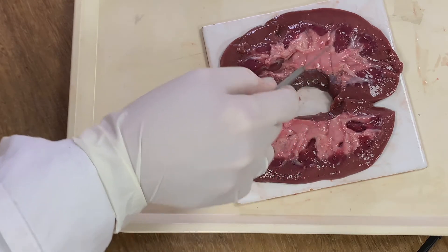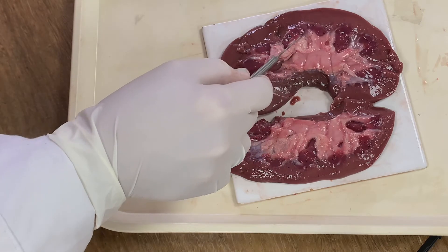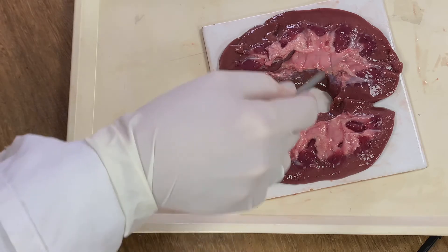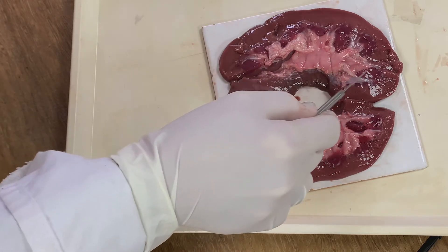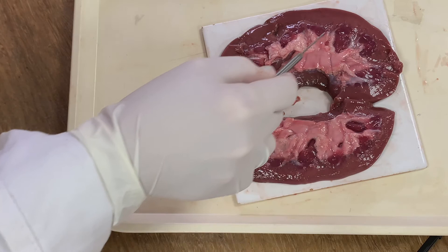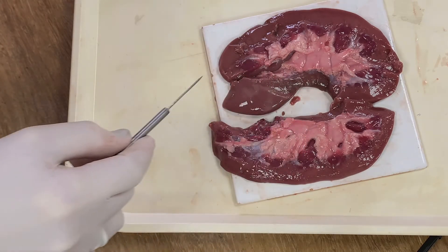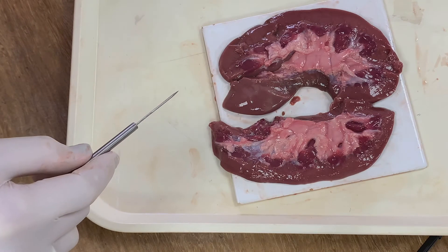The next layer in is the medulla, where the Loop of Henle and collecting ducts are found. It is split up into a number of sections known as the renal pyramids, which are the red areas divided by the calyces. The calyces are tougher white areas where collecting ducts join to enter the pelvis, and the pelvis then runs into the ureter.